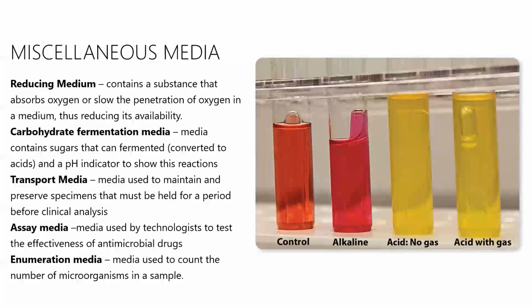It hasn't deteriorated. We can also use assay media. This is media used to test how effective different drugs are on that bacteria. So trying to determine which antibiotic, which antimicrobial is proper to use on that particular pathogen.